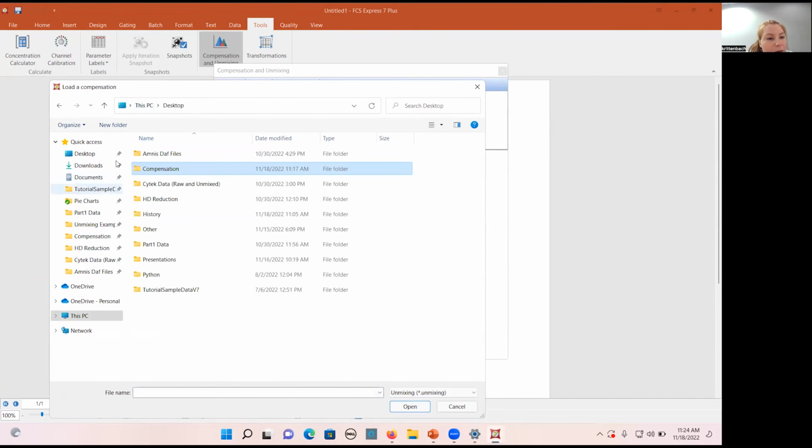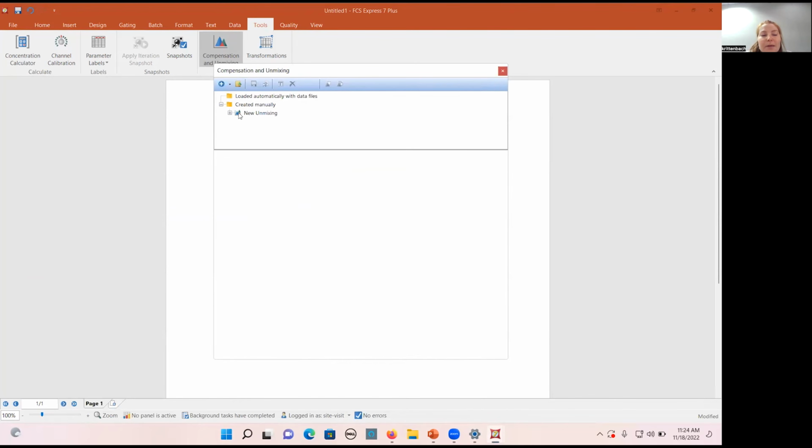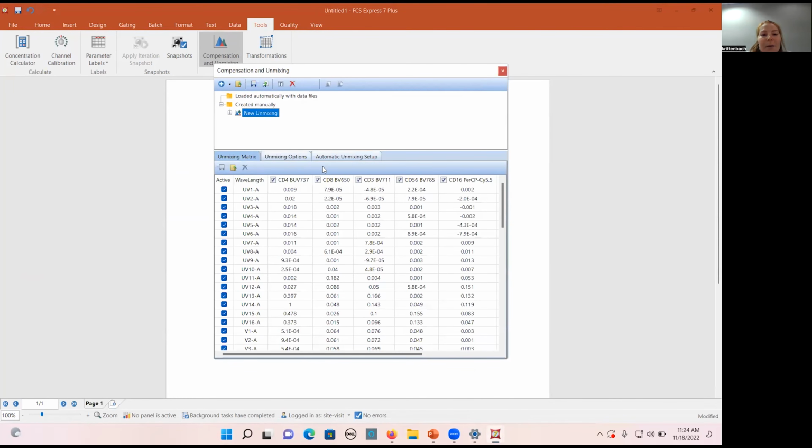I think, where did I save it? Here? Yeah, saved it here. And you can open that and then that will be here. And again, you can apply that to your plots.